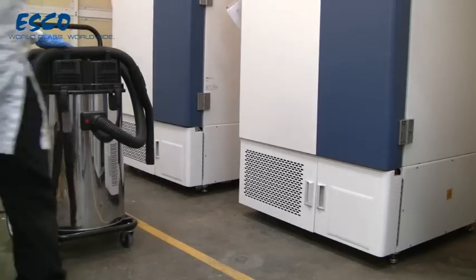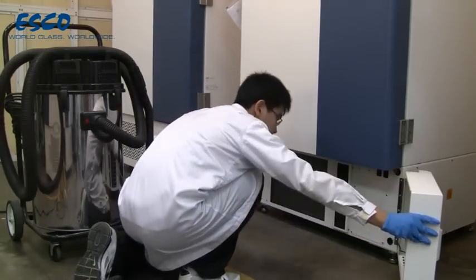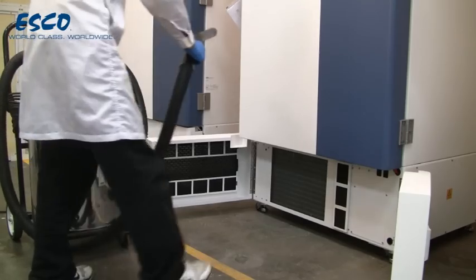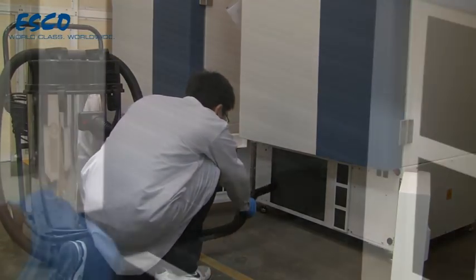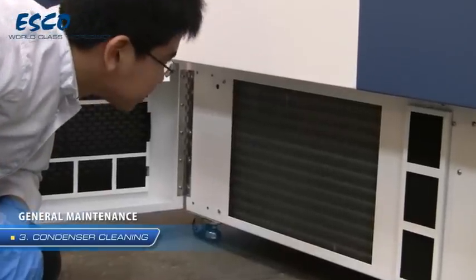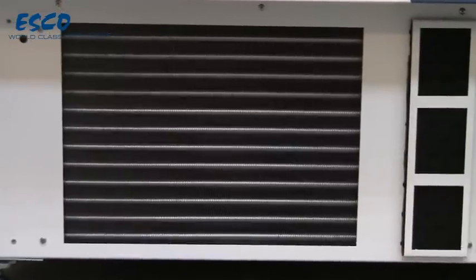To clean the condenser, pull open the left and right bottom doors. Use a household type vacuum cleaner to vacuum the fins. Make sure you can clearly see through the fins after the vacuum operation is completed. The condenser should be cleaned once every six months, or more frequently if the area is dusty.